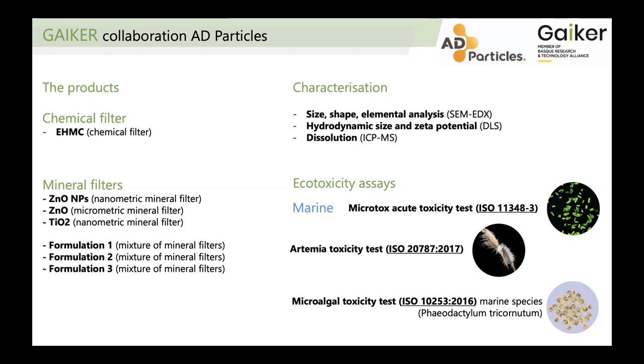So the materials that we tested were basically split in two types of materials. We had a chemical filter, EHMC, and then we had some options of mineral filters. So we had three individual particles: titanium dioxide, zinc oxide, and zinc oxide in nanoform. And then we also have three formulations, which are basically mixtures of these mineral filters in different proportions, but basically using zinc oxide, titanium dioxide, and other metals.